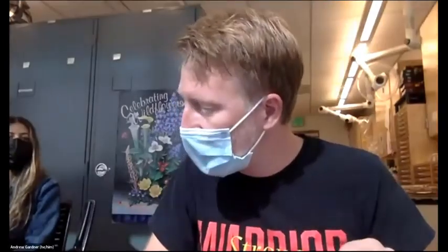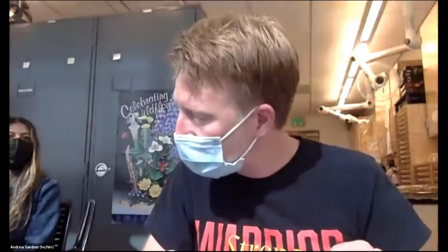On our plant collections, you'll see the label not only has information about what the plant is, so yours have the family, the scientific name, and also the common name. They also have information about where that plant was collected. So it says location, Trans-California Pathway, Stanislaus State, Turlock, California, 95382, right? That location tells you where that plant was found.